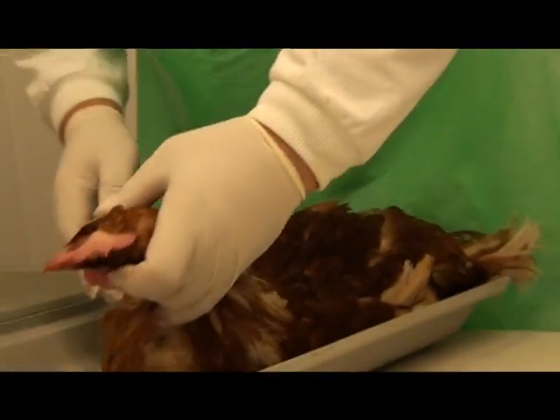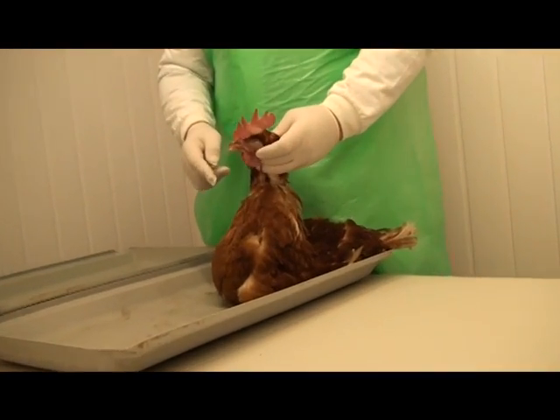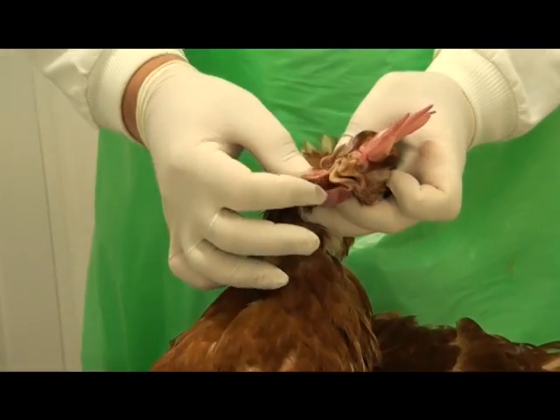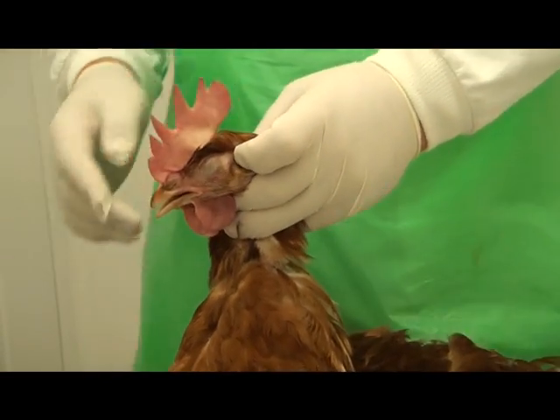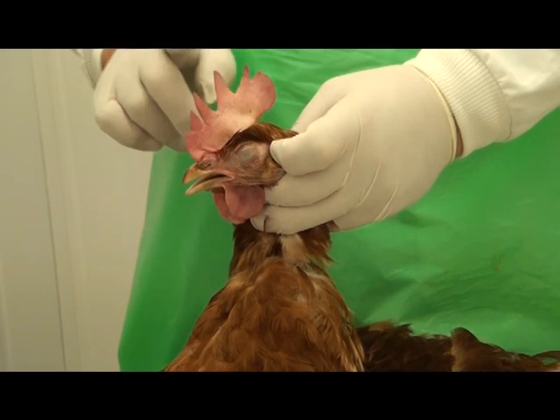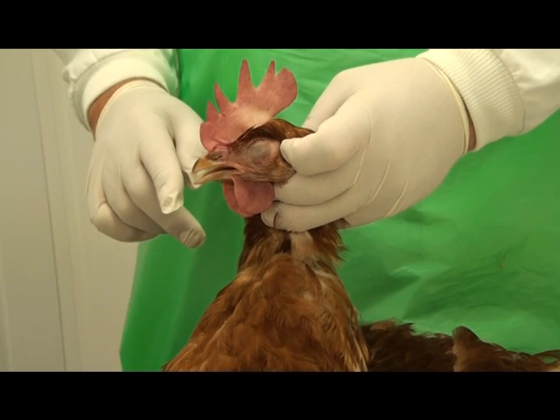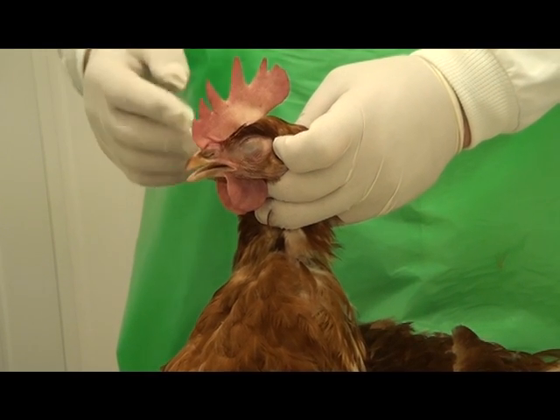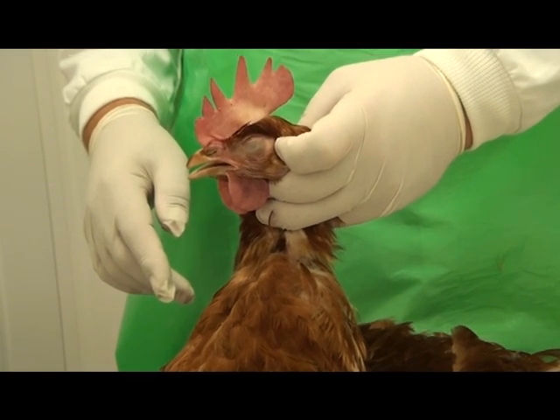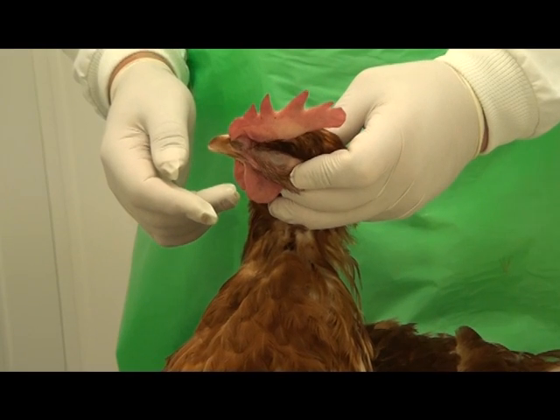If we start from the head, the first thing we notice is the comb and the wattles. These should be erect, as in this bird, rather than folded. That shows that the bird is healthy. And also should have a very deep red colour, and that's because this area is very well perfused with blood. It acts almost like a radiator for the bird to lose heat.